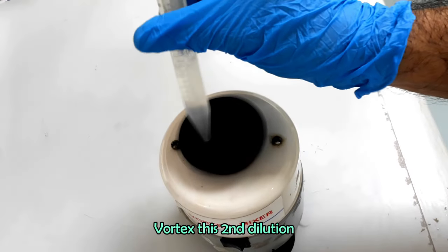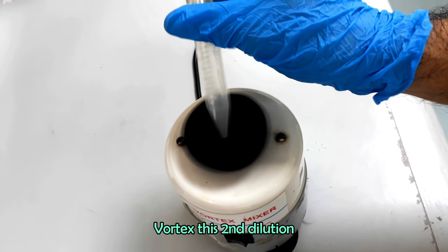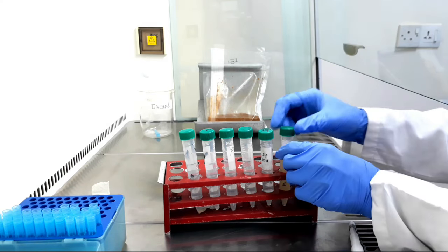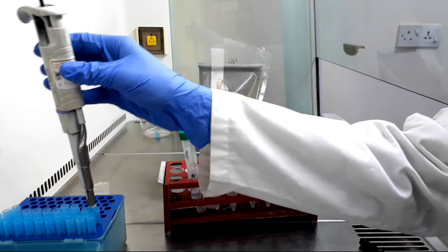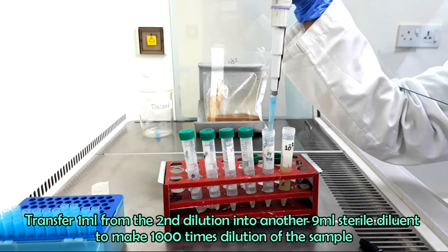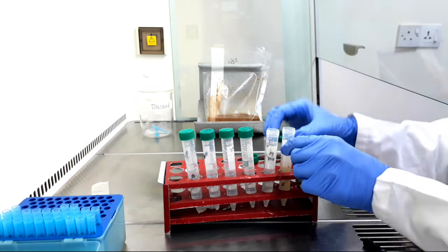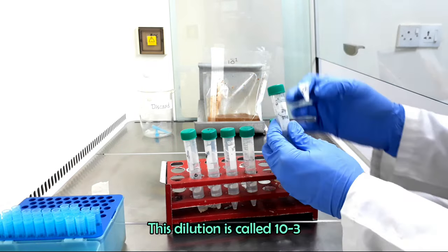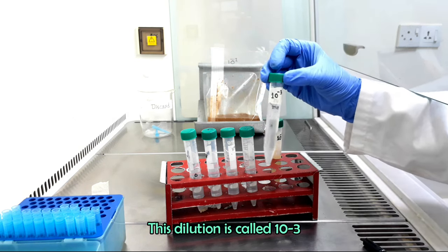Vortex the second dilution. Transfer 1 ml of the second dilution into another 9 ml sterile diluent to make 1000 times dilution of the sample. This dilution is called 10 inverse 3.